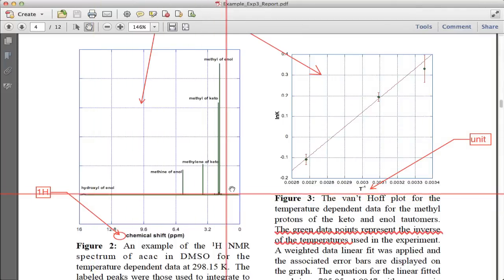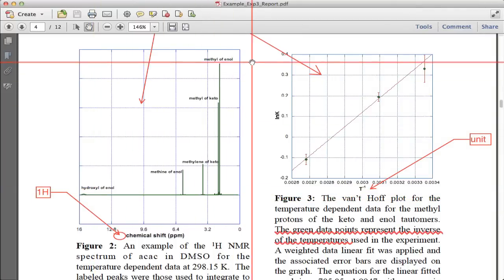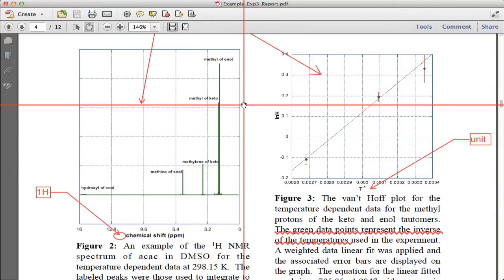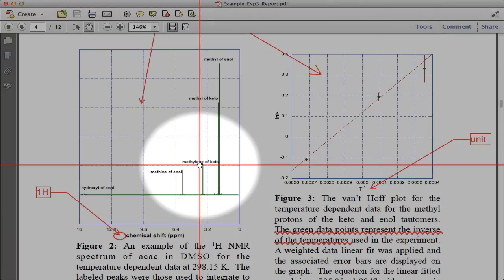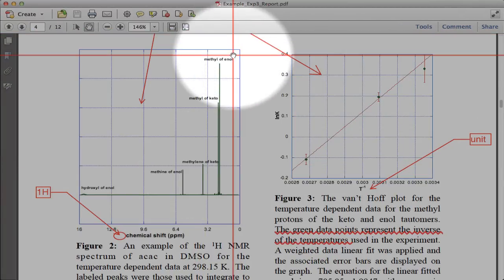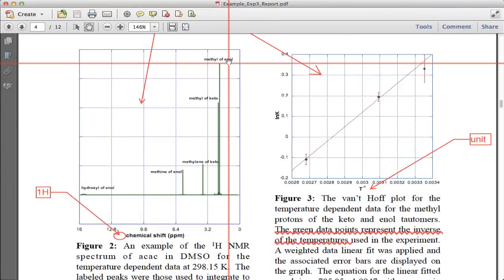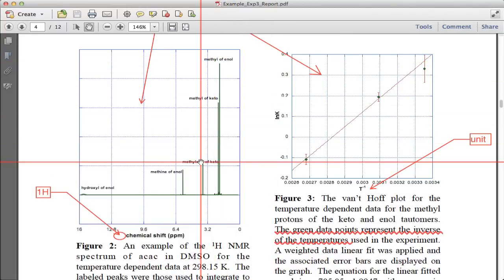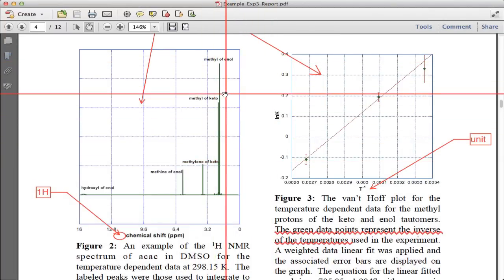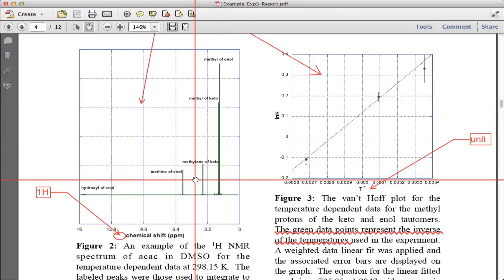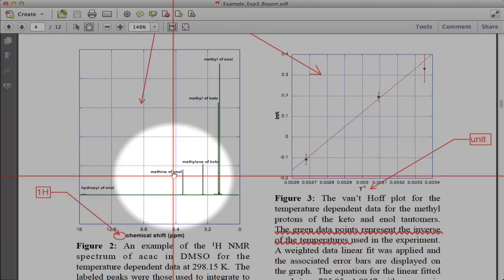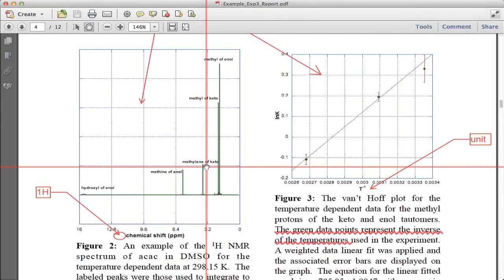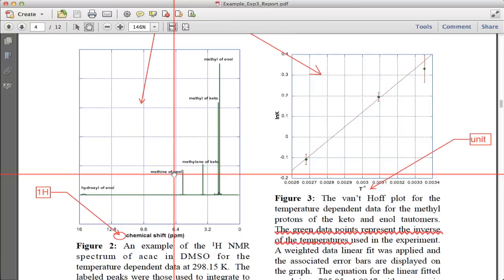They probably should blow that up and show that in a little more detail. You can integrate each of these peaks individually. You can do some for consistency like for example the methylene of the ketone versus the methyl of the ketone should be in a six to two or one to three ratio and you can make sure you get self consistency. Then of course when you average anything of the enol to the ketone it gives you the percent once you take into account how many protons are in each of those.